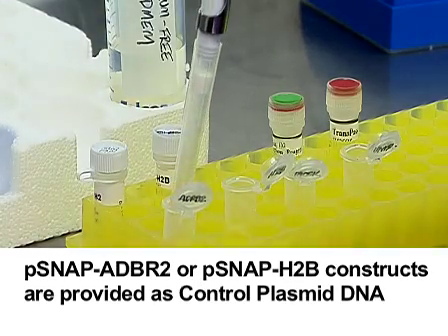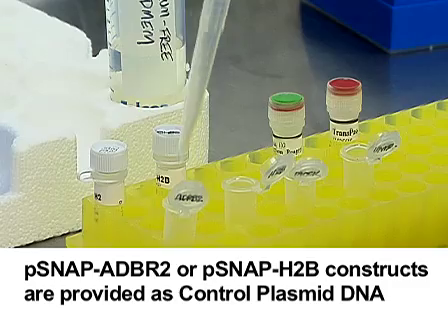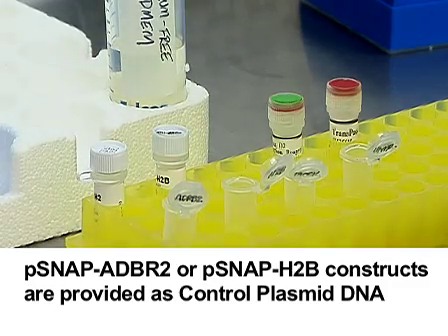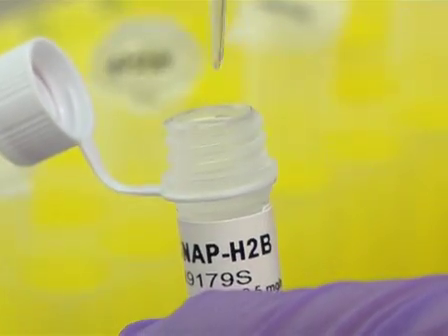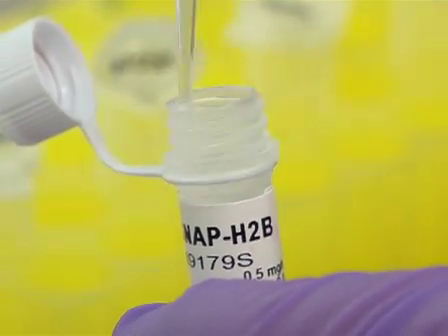Control plasmids are available to assay for the efficacy of the transfection reagents. We also recommend including a mock-transfected sample and/or an untransfected sample as negative controls.